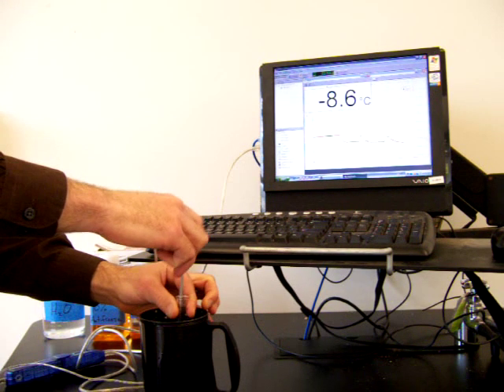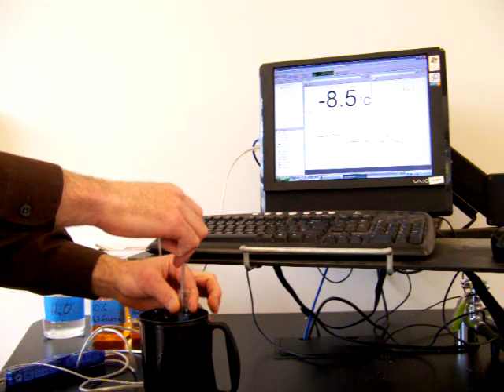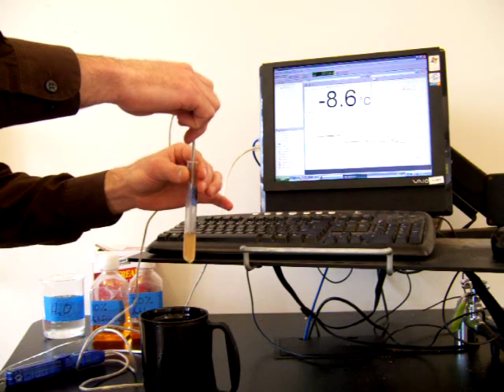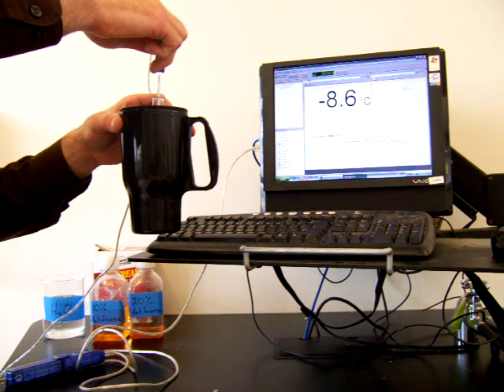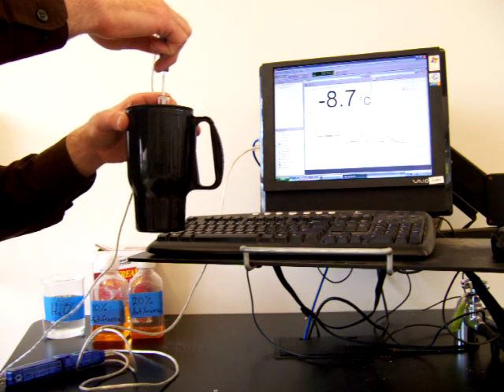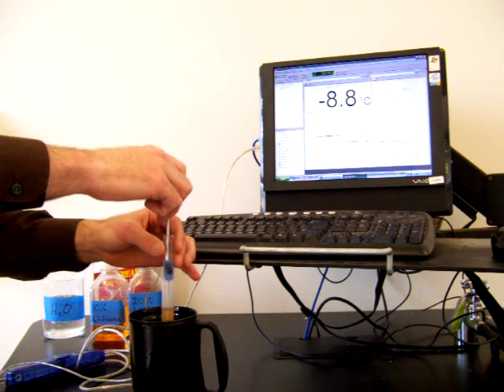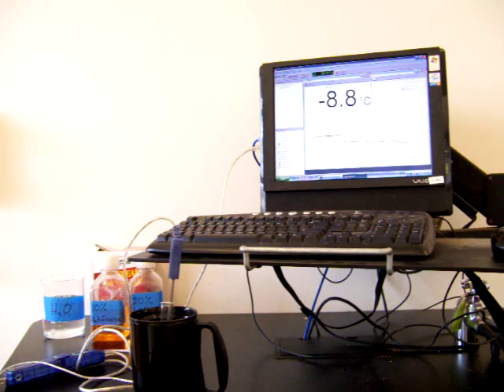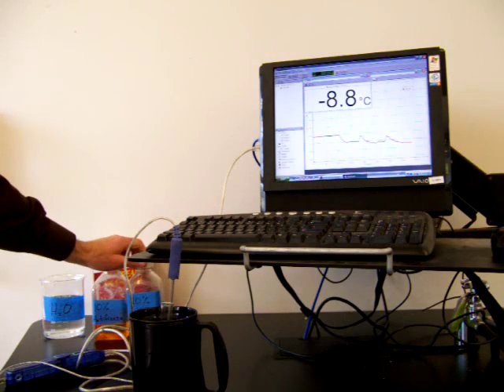It's not forming a full block of ice, but it is starting to freeze. Let's see where it leveled off, negative 8.5 degrees Celsius. Looks like the freezing point of this antifreeze solution. Negative 8.5 or negative 8.6 looks like the freezing point. Now that it's frozen, it will continue to drop in temperature. That's the data you need to calculate the molar mass of antifreeze.